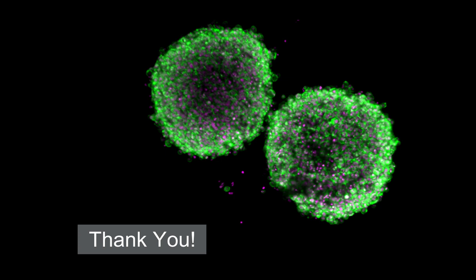Okay, so Chris, your first question is, how can I reduce photo bleaching or phototoxicity when imaging thick samples?